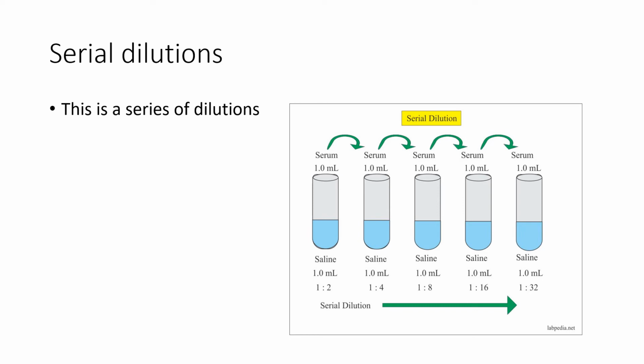And in the third tube, after we've serially diluted, we still have the same tube dilution, which is 1-to-2, and that 1-to-2 is 2 times more dilute than the 1-to-4 tube, so the concentration in the third tube would be a 1-to-8 dilution, 1-to-8 titer.